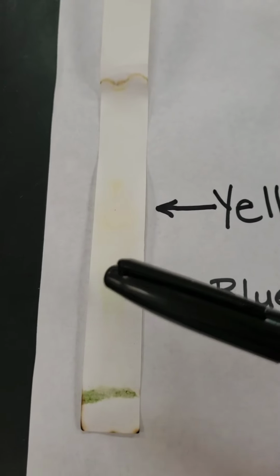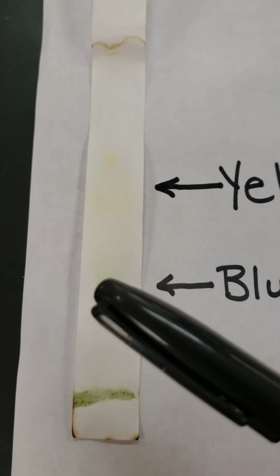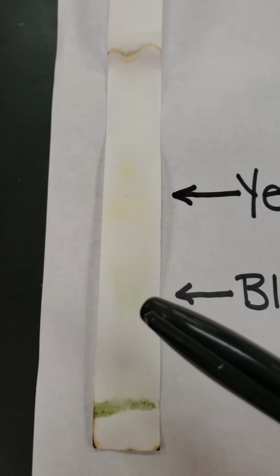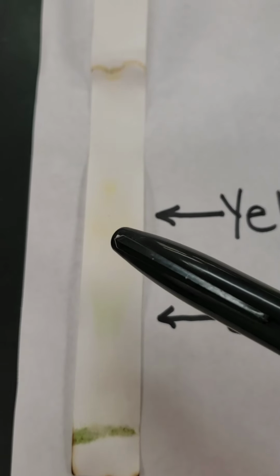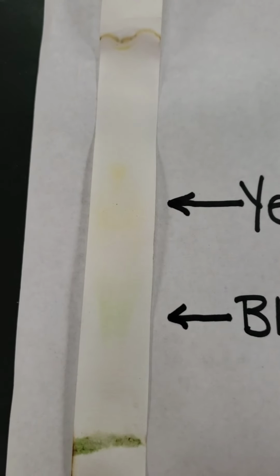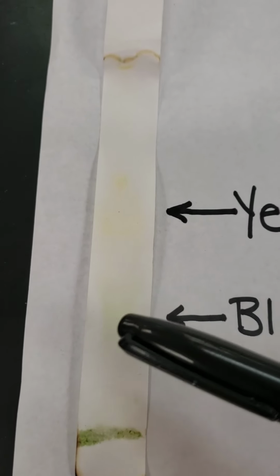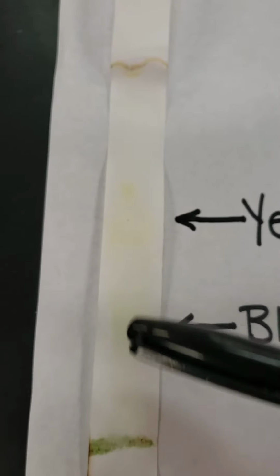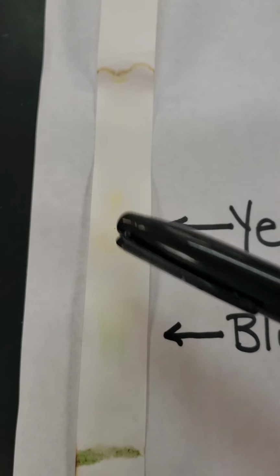Now I see right here, it's really light, it's hard to see. Right there, it's bluish green. So that is a pigment that makes up chlorophyll. And then up higher, here's pure yellow. There's another pigment that makes up the chlorophyll. The yellow didn't separate completely here. Otherwise, this would be totally blue, so we would have blue, yellow.